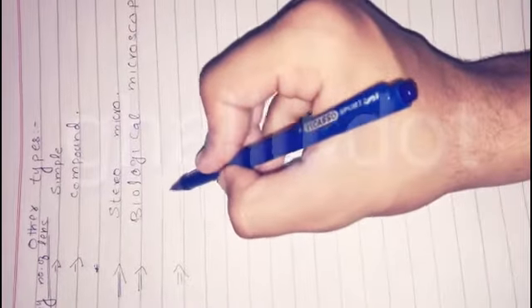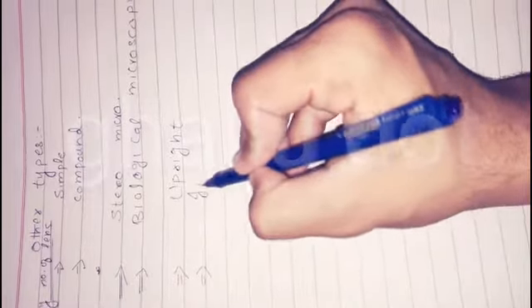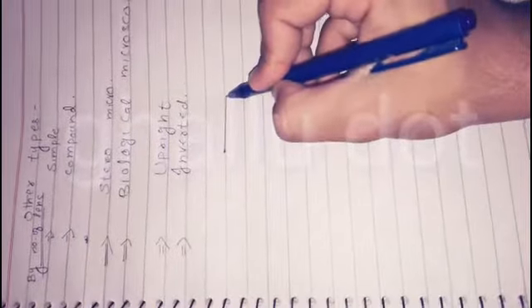Similarly, there is the stereo microscope and the biological microscope. The biological microscope is used nowadays, and the stereo microscope is also used by taxonomists to see the morphology of a large object, like Musca domestica or a bee. Outside, we can use the stereo microscope. Similarly, next one is the upright microscope, which we will discuss later. Just see the video.